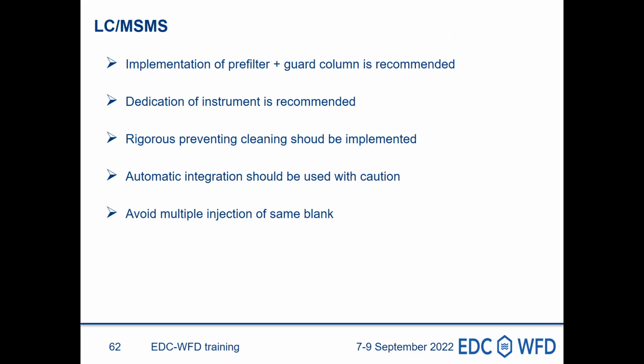Automatic integration should be used with caution because we have had some problems in the project with this automatization of the process, especially when you are in complex matrix at low level. It is really important to check and to do it manually many times. Otherwise, you have a significant impact on the quantification. It is also a recommendation to avoid multiple injections of the same blank because otherwise you will face some cross-contamination in your process.